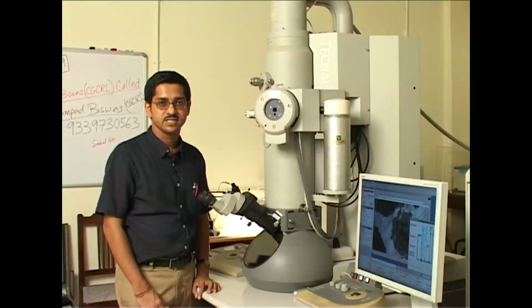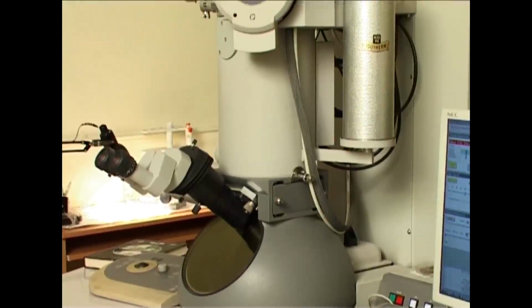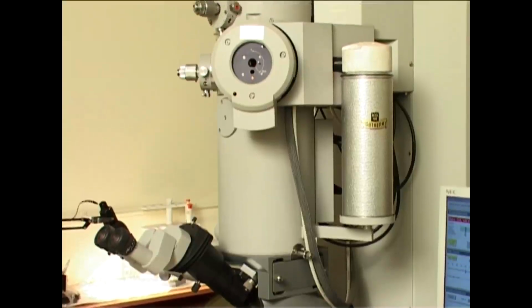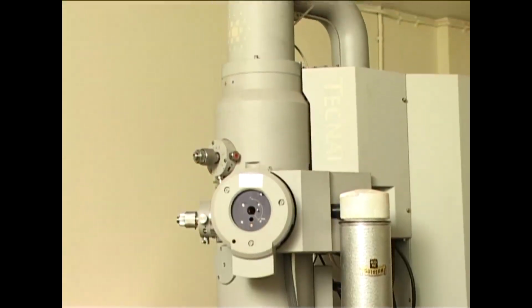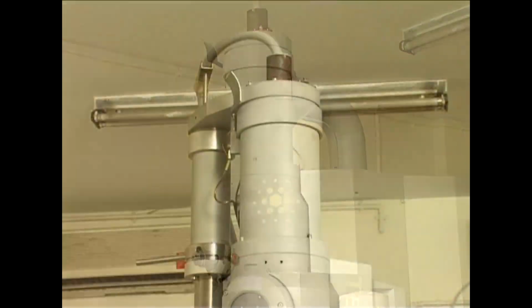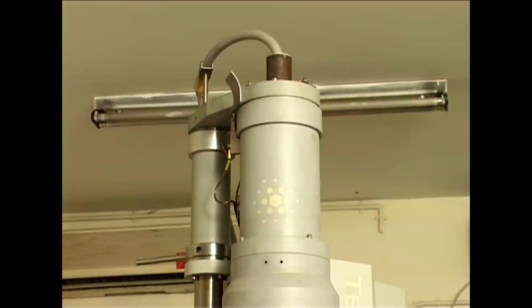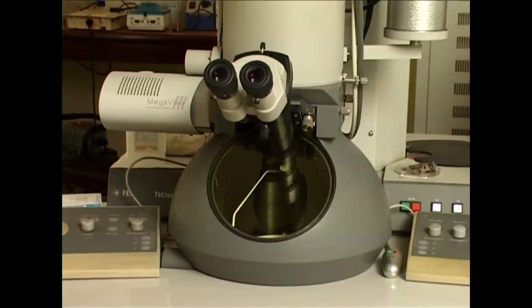Now we are at the TEM facility. What you are looking at is the transmission electron microscope, the FEI Tecnai G2 BioTwin. The most important component here is the electron gun placed at the top, and this is 120 kV. The electrons pass through the condenser lenses, and then you can put your sample in between, and then there are the objective lenses, and it gets focused on the screen which you can observe manually.